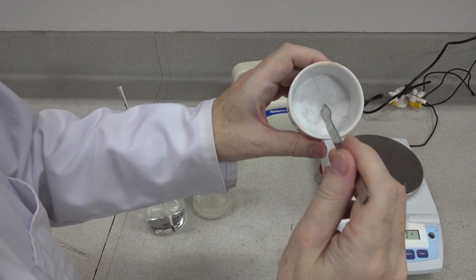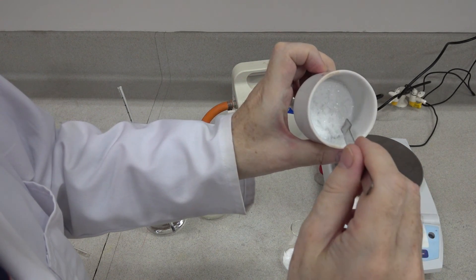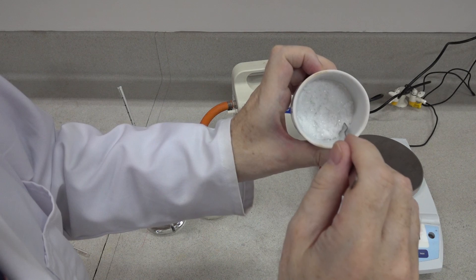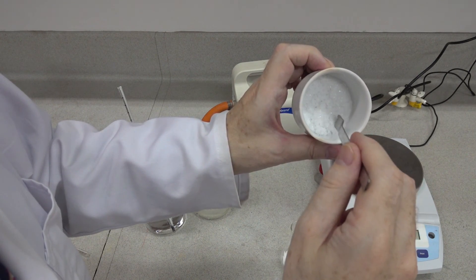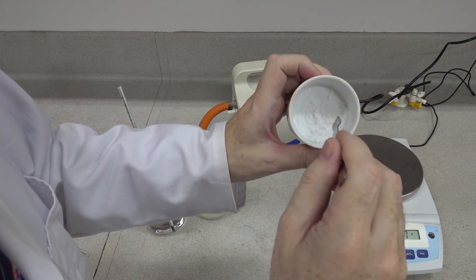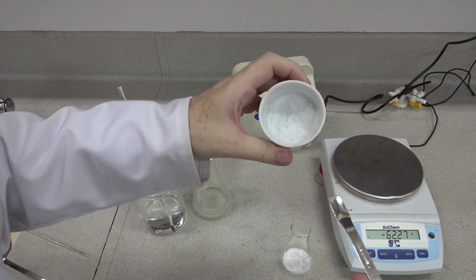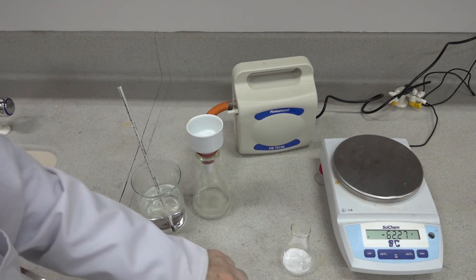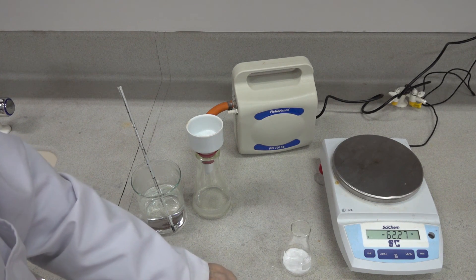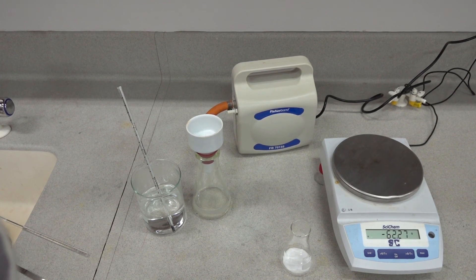There's quite a yield of recrystallised material there. We can perform a melting point on it and compare to the melting point of a standard and our crude product. So that's the preparation of aspirin using an addition-elimination reaction by reacting acetic anhydride with 2-hydroxybenzene benzoic acid (salicylic acid).